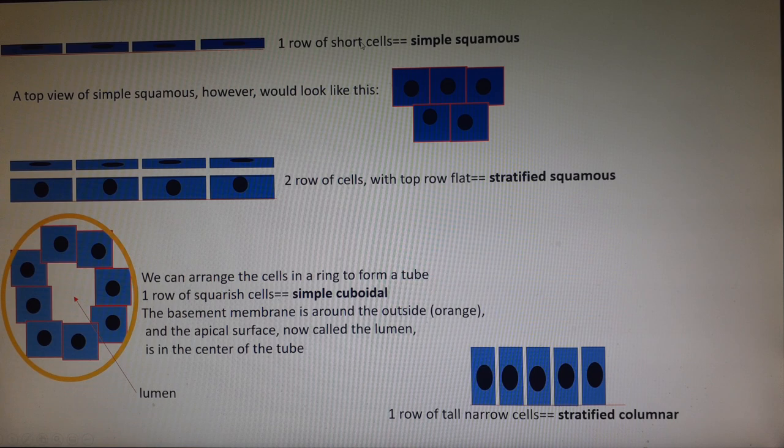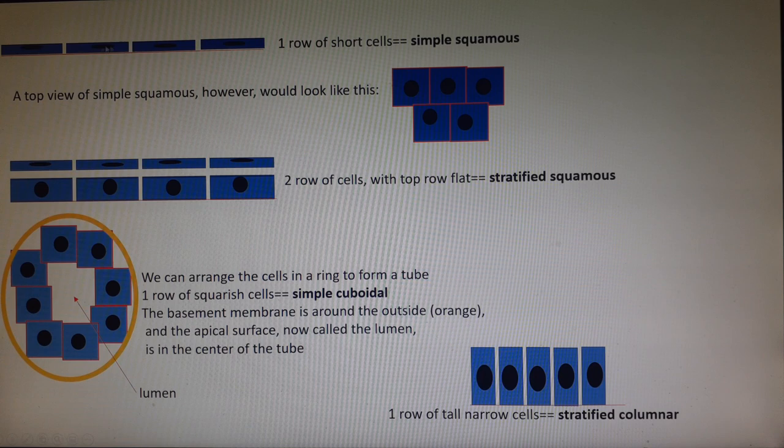So if I have one row of short squatty cells — and my basement membrane here is shown in red — I would say that the name of this tissue is simple squamous.